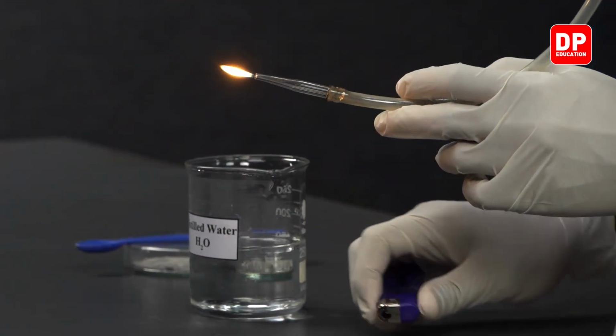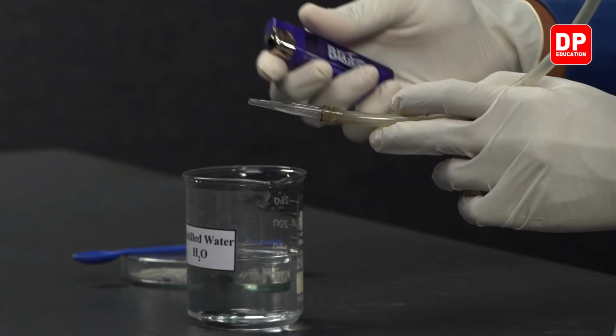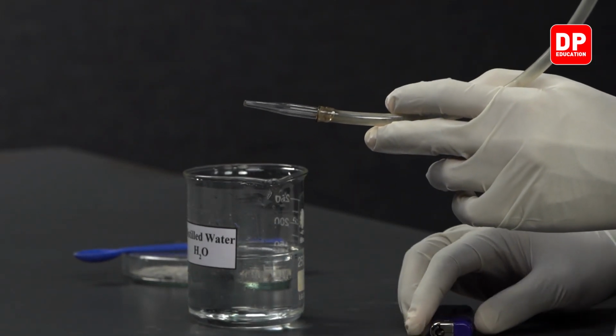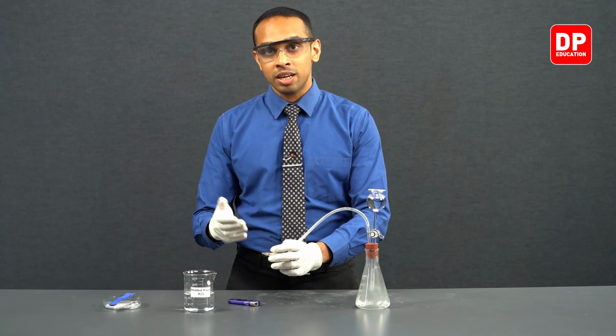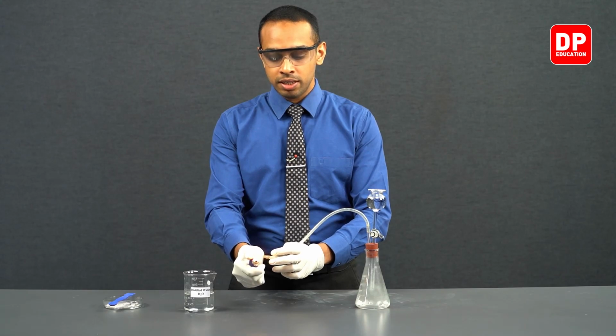You can see here, we are producing a small flame and the acetylene gas burns when we provide it enough heat. When it reacts with oxygen, it will burn, producing carbon dioxide and water. We'll observe it again.